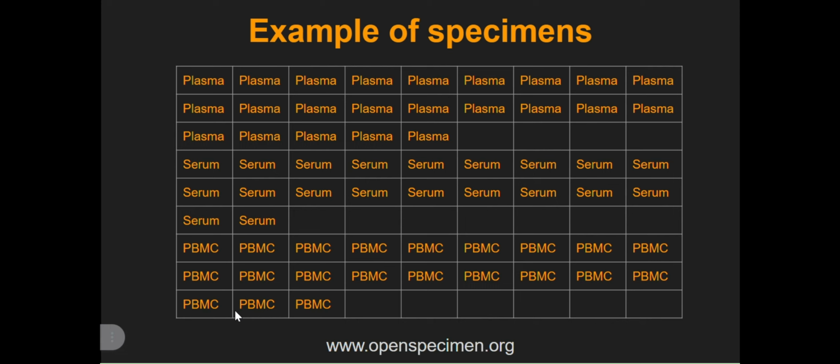So while creating this aliquot, it will automatically generate a primary specimen and a derivative. For example, it will generate a whole blood in EDTA vacutainer as the primary specimen. It will automatically generate a plasma derivative and then add all the plasmas as aliquots under it.